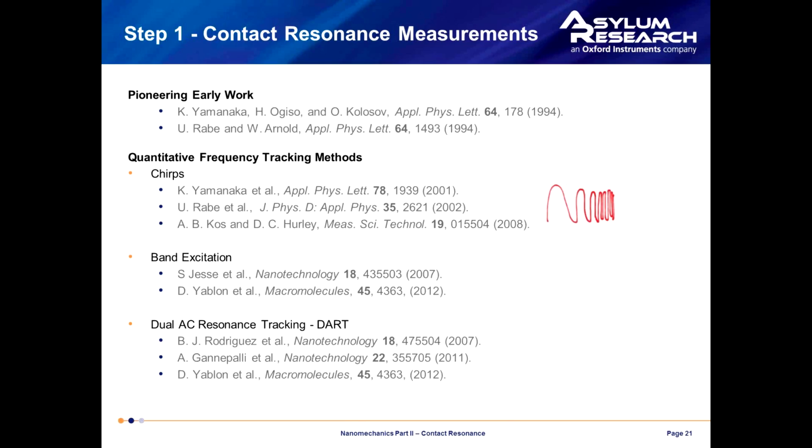This method can suffer a bit from speed issues, and it may take a while to acquire an image, but it is very straightforward and produces nice results. Sort of tried to indicate that here with this frequency that changes as a function of time.